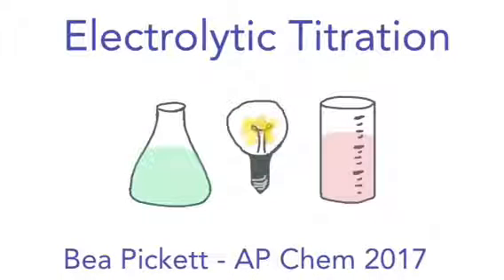Hello and welcome to Electrolytic Titration. In this demo, we will be investigating the relationship between electrolyte concentration and conductivity.